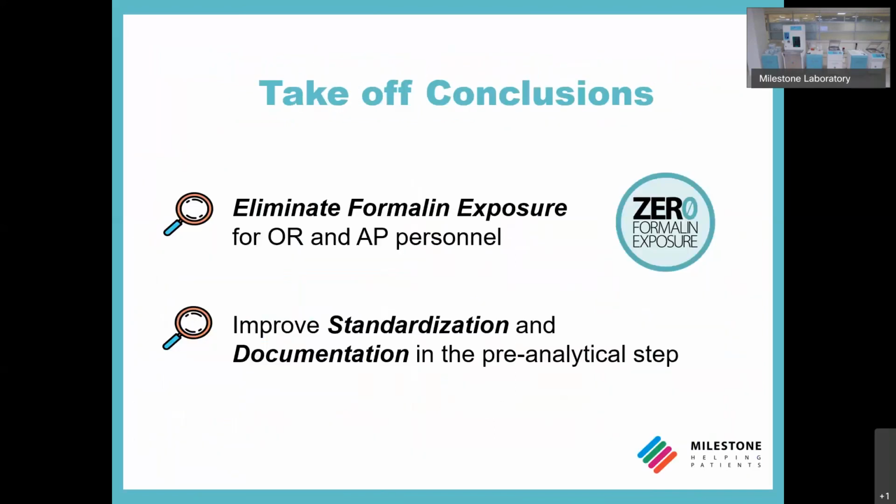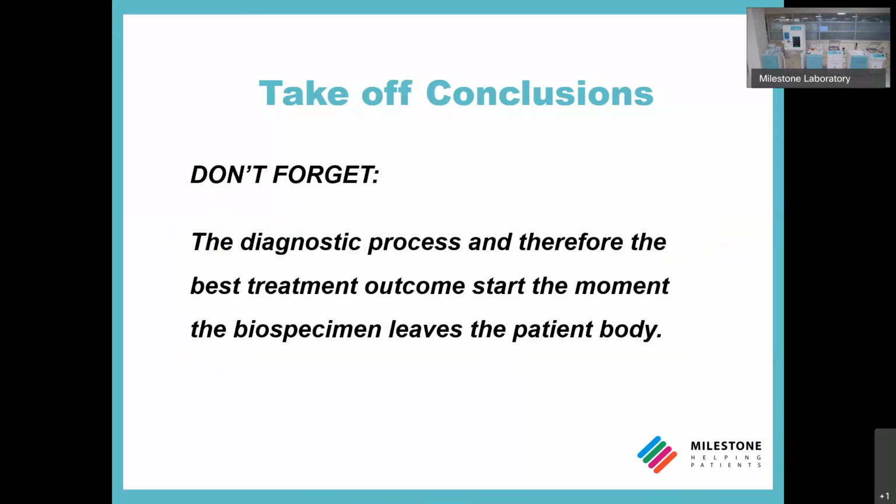So before leaving the stage to my colleague Marco, the takeaway conclusions of my presentation, as mentioned at the beginning, are these two: eliminate formalin exposure for operating room and pathology laboratory personnel. Today it is a must. We cannot go around it anymore. Second point, for precision medicine and molecular diagnostic advancement, the standardization and documentation in the pre-analytical step is essential. Same thing, we cannot go around it anymore. Don't forget, the diagnostic process and therefore the best treatment outcome start the moment the biospecimen leaves the patient's body. Thank you for your attention. I now give the stage to Marco Perrella.